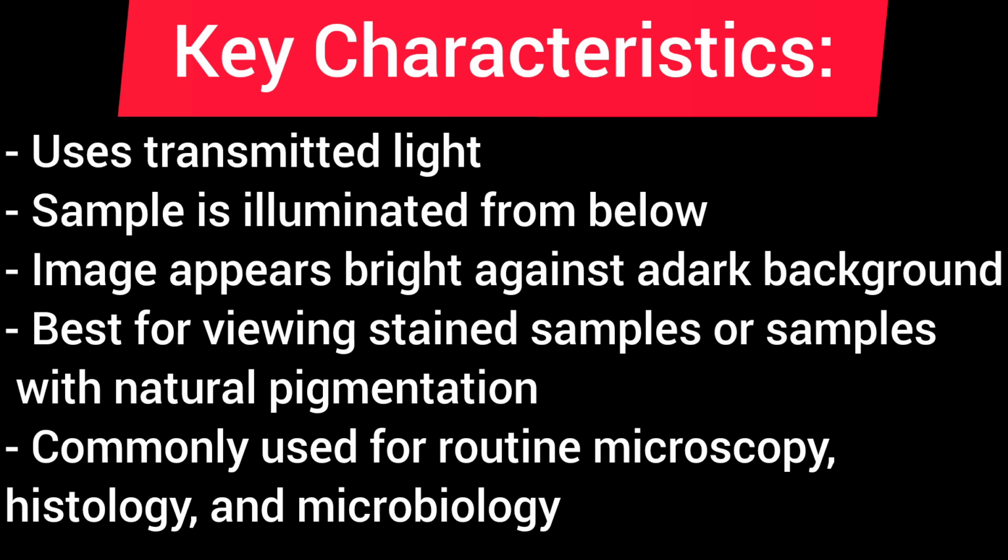Image appears bright against a dark background. Best for viewing stained samples or samples with natural pigmentation. Commonly used for routine microscopy, histology, and microbiology.